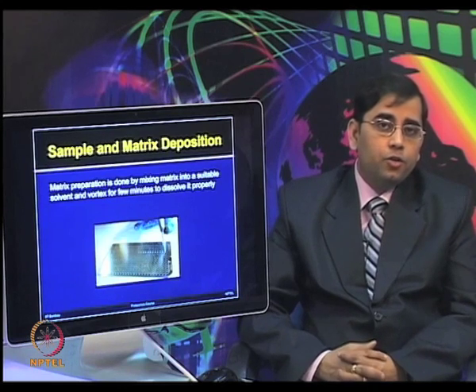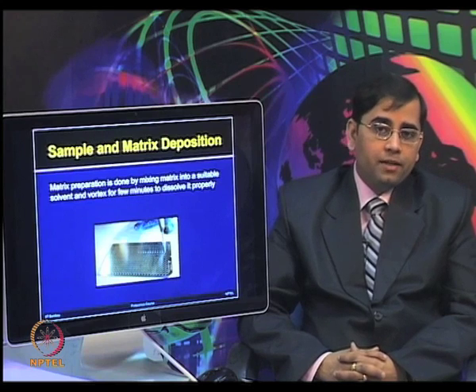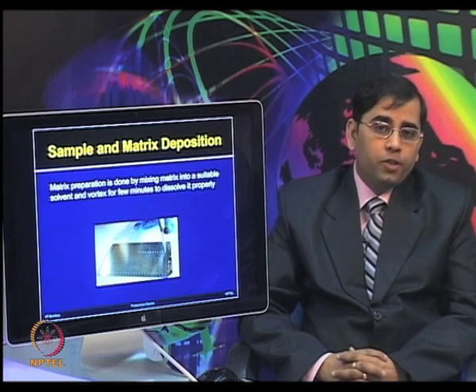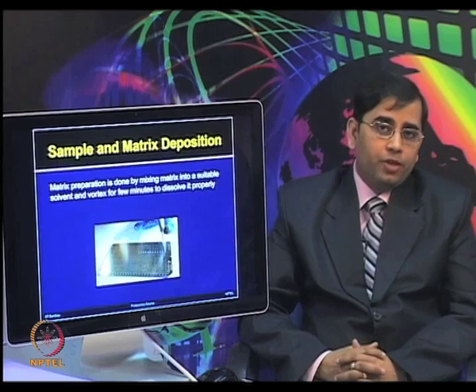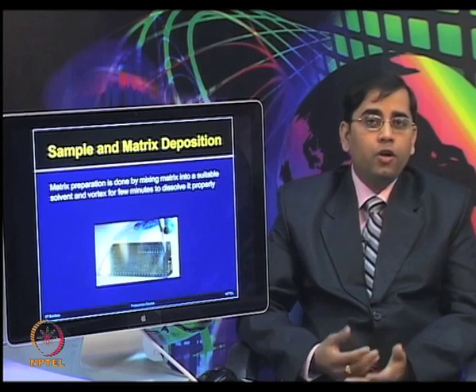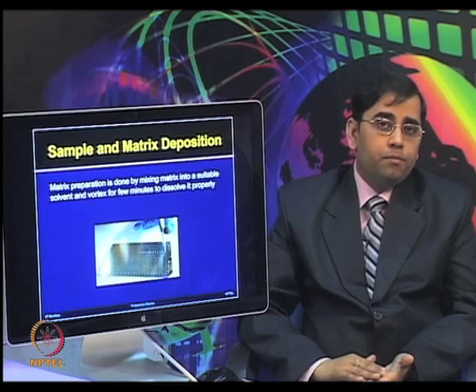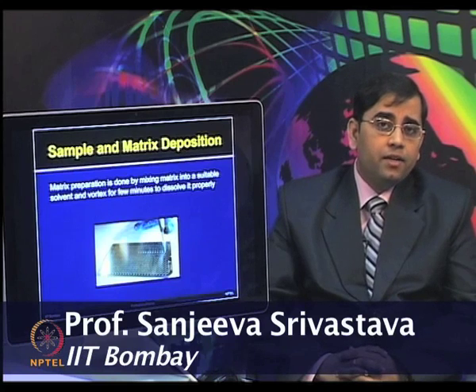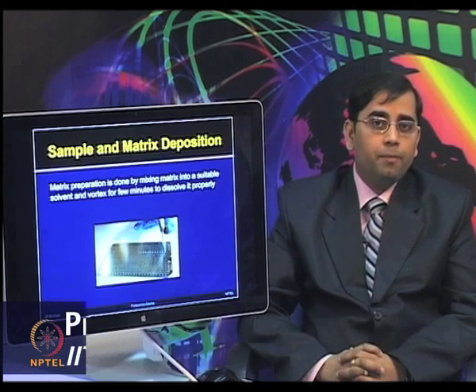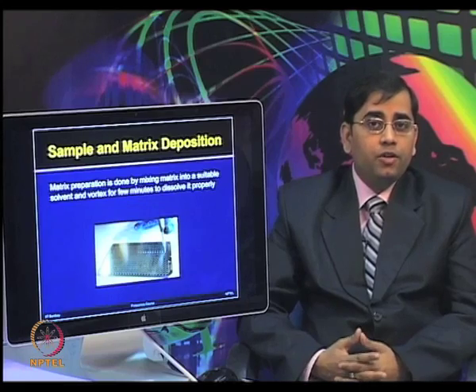Another way of doing this is the sandwich-based method, in which first a small amount of matrix is deposited on the plate, then you add the protein sample, and again the matrix is spotted on top of it, so that you have enough matrix below and above the analyte. So, one can try different combinations of placing the matrix and the analyte, and once you have placed all of the samples of interest on the MALDI plate, you are ready to dry the target plate.